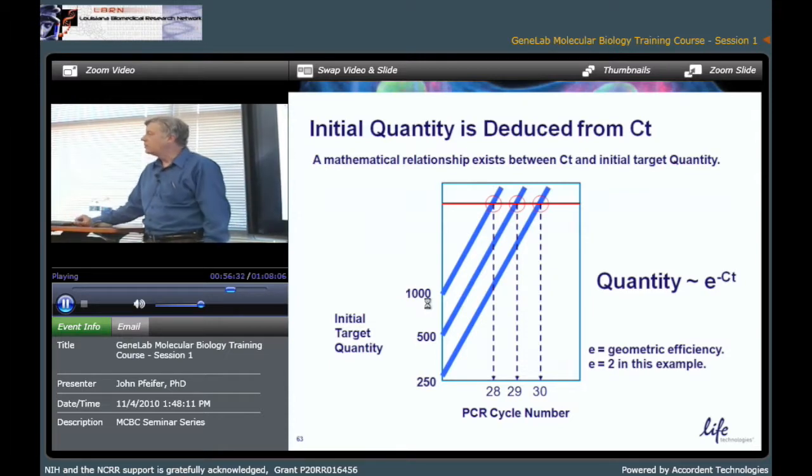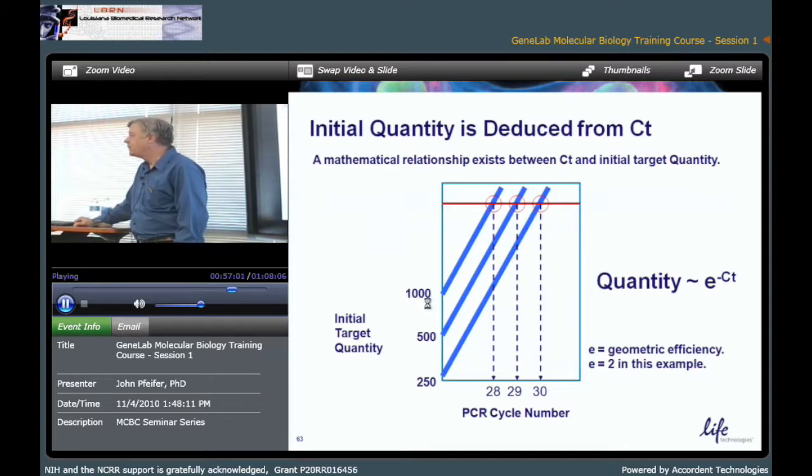You mean here? Yes. Okay. So when you want to compare samples using just the threshold, you mean the CTs? Yes. Is it possible to assign a number, or in this case, we'd probably say it crosses at, say, cycle 26 and, say, 28 or something to that effect. Okay. Now, aside from the cycle number, is it possible to assign a number to compare those two samples? You know what I'm saying? One of those samples that crosses early has possibly higher starting material, whereas the one that crosses later has less.